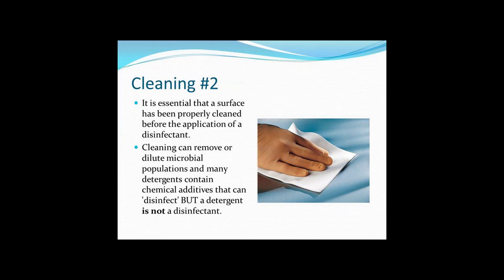So cleaning can be effective in that. And in addition, cleaning can also help to remove some microorganisms that are not attached or bound to surfaces, and it can dilute down the population. And some detergents contain weak chemicals that have some disinfecting capability, but importantly, a detergent is not a disinfectant, and cleaning alone does not eliminate microorganisms.